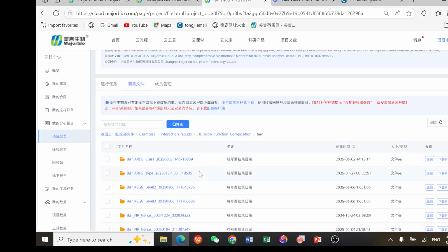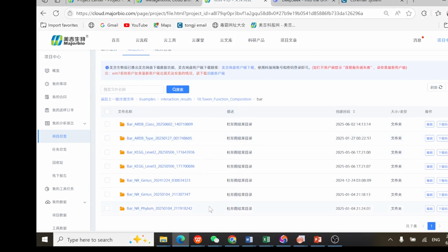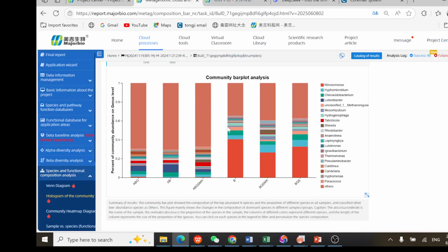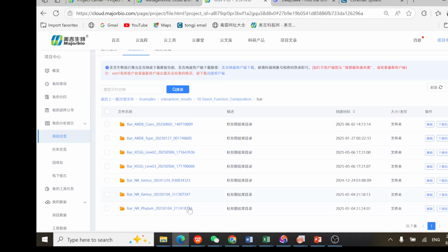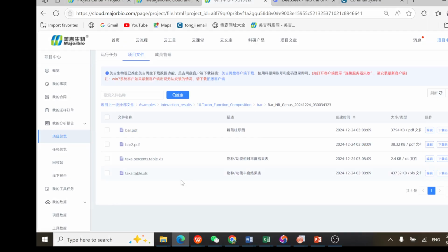Now, how did you know the one that you are going to use? So you go to this your image, come up of this image, look at this number. This number ends with 4323. So you go to this place, look for 4323. Here it is, 4323. You click on it, then it brings you here.